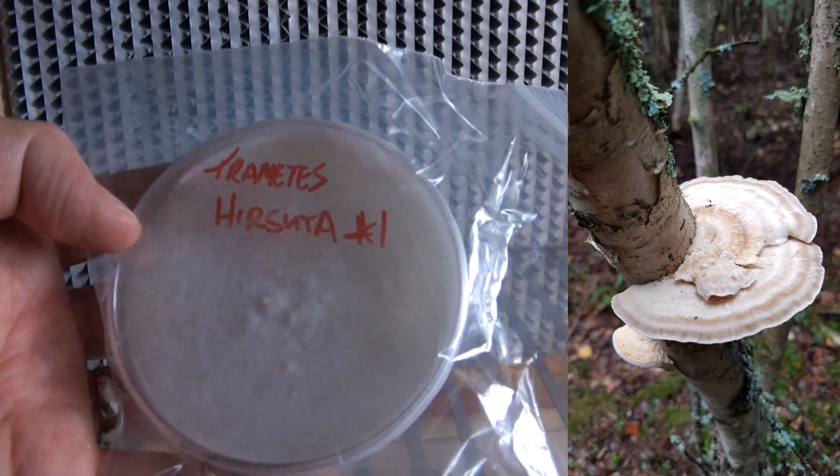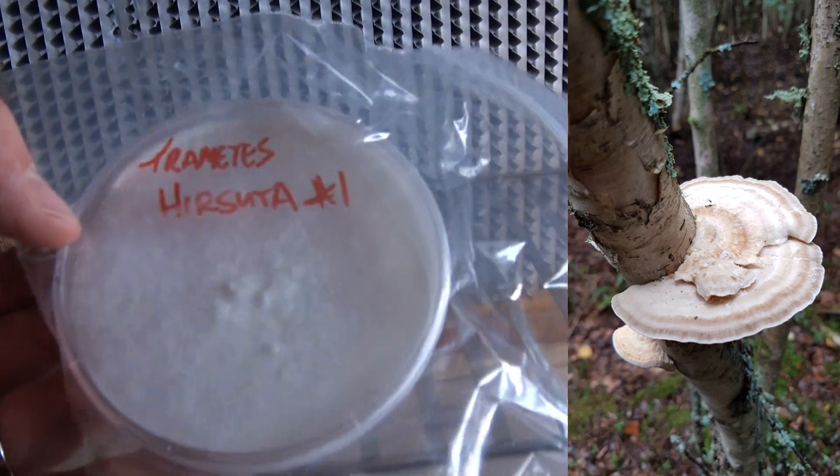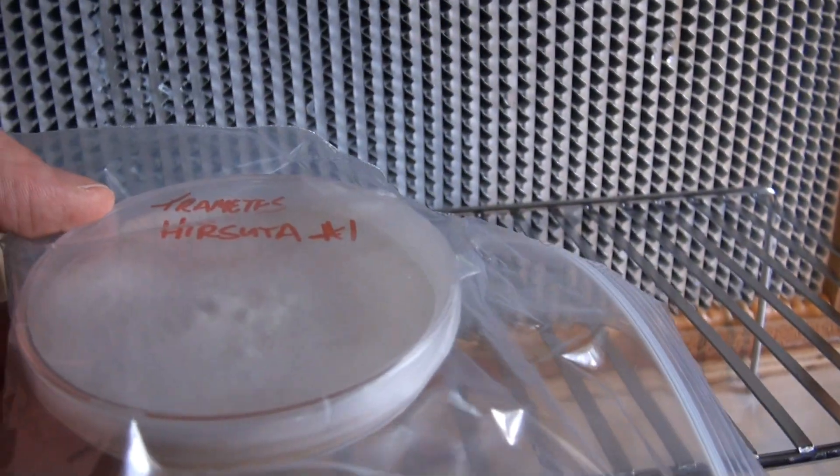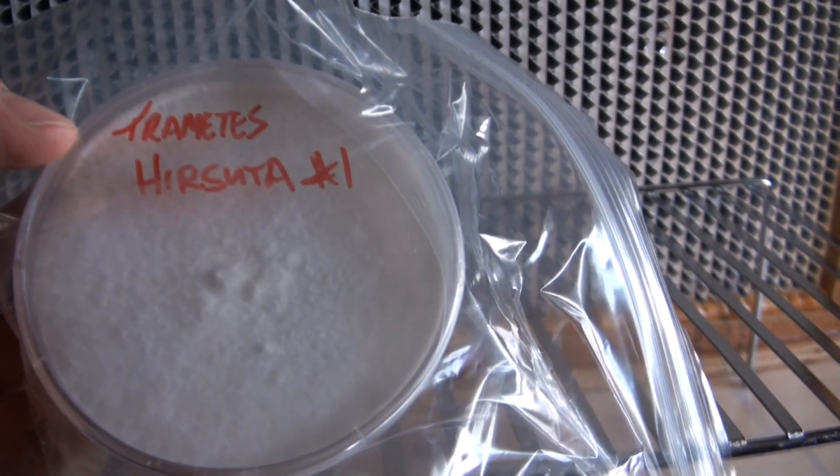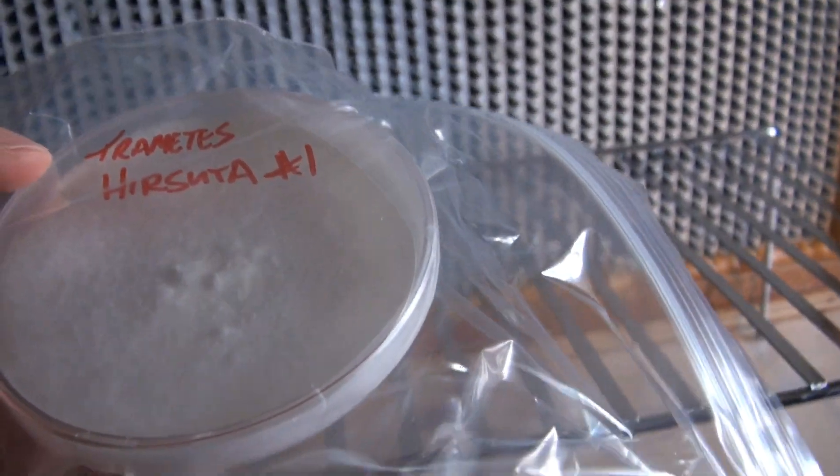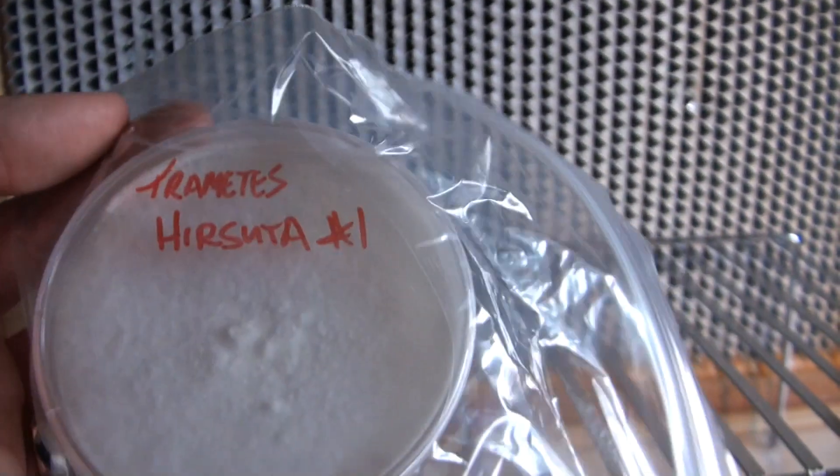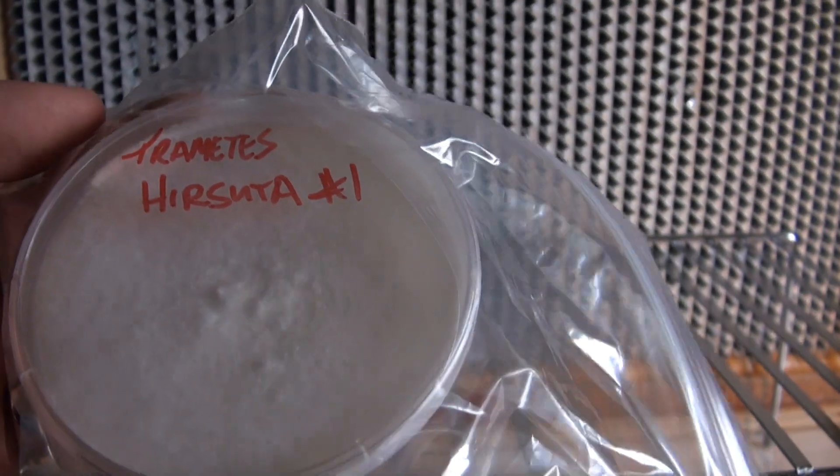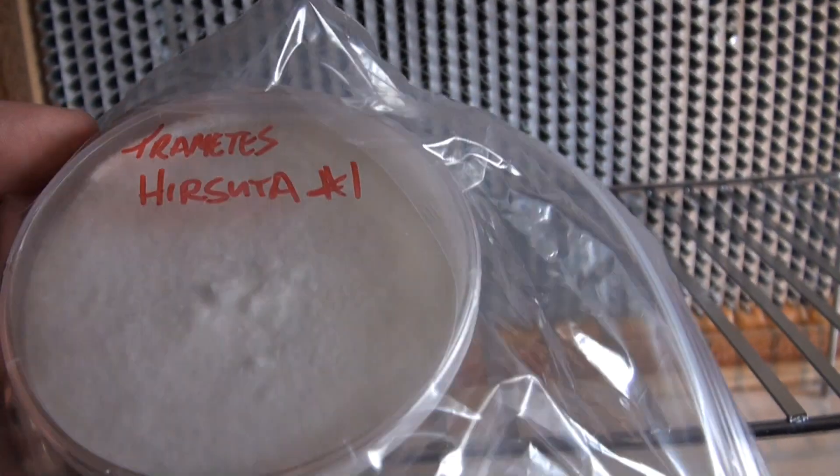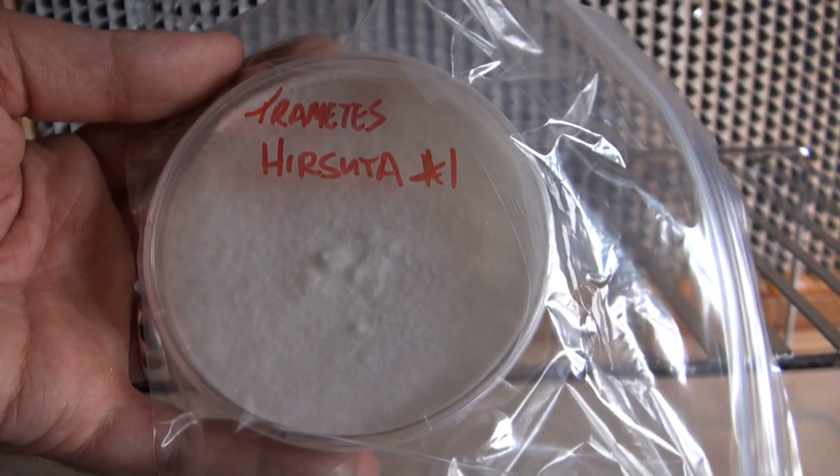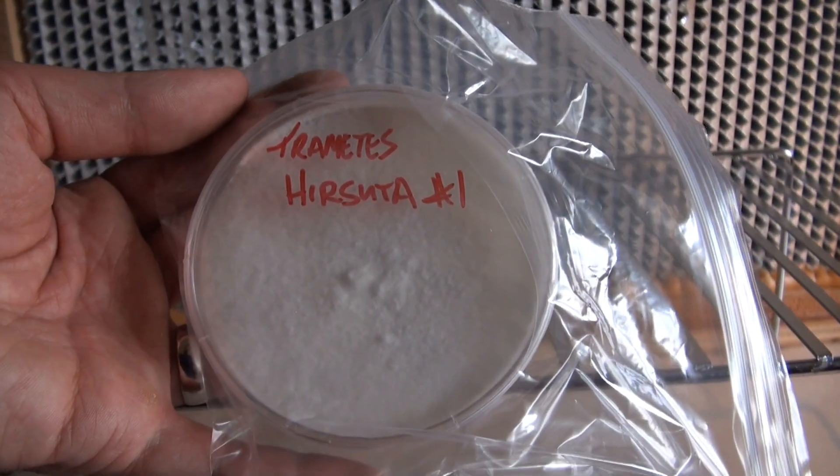So I just want to show you some examples. This is a Tremella species that I cloned. As you can see, this was the first transfer and it's filled with nothing but pure white mycelium. So in the very first transfer we got a pure culture. I'm going to continue to culture this out just to make sure there's no contamination. But there's one example of a clone from a wild species that went really well.